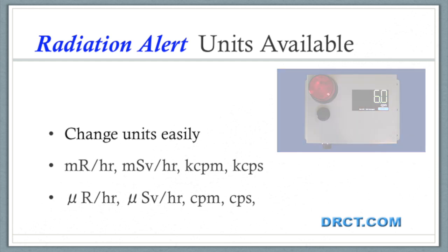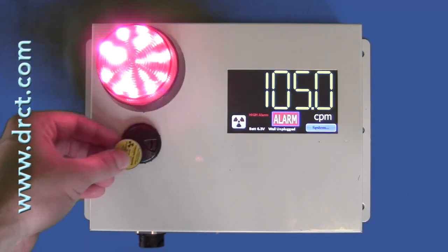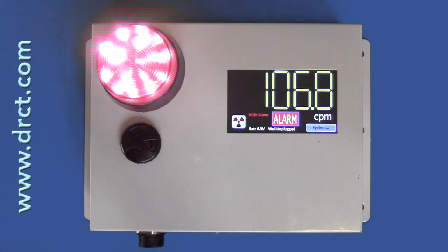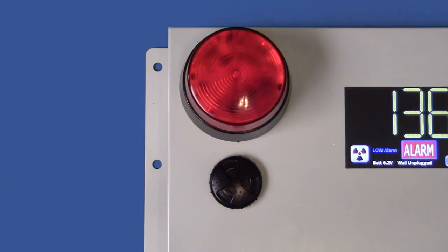Now we will test the alarm using a 10 microcurie cesium-137 check source. To acknowledge or silence any alarm, tap the alarm control at the lower center of the screen. Built-in indicators feature an ultra-bright strobe and an audible alarm, as you can see.